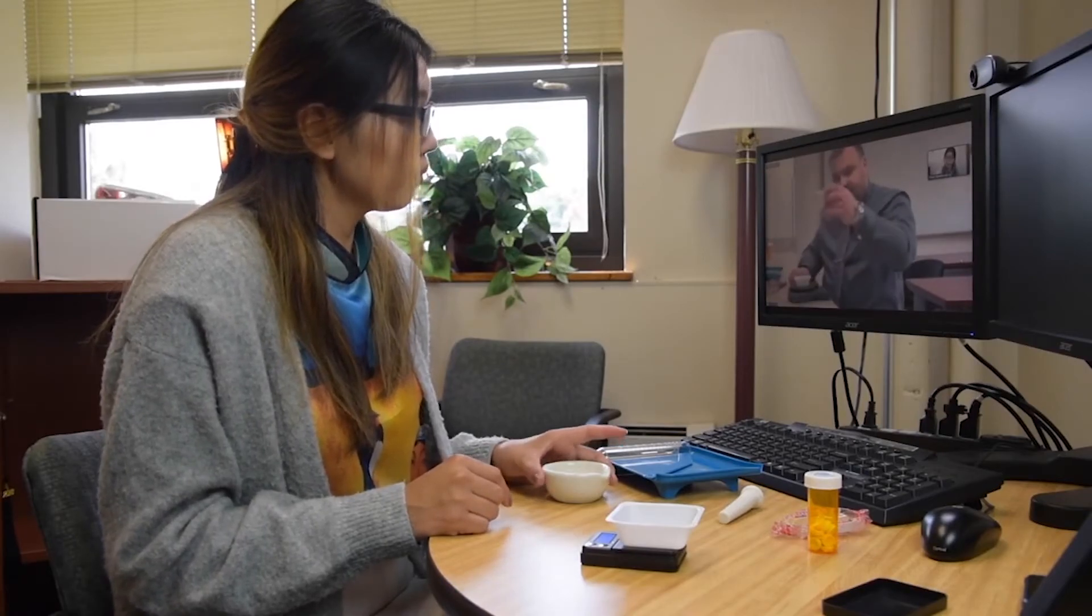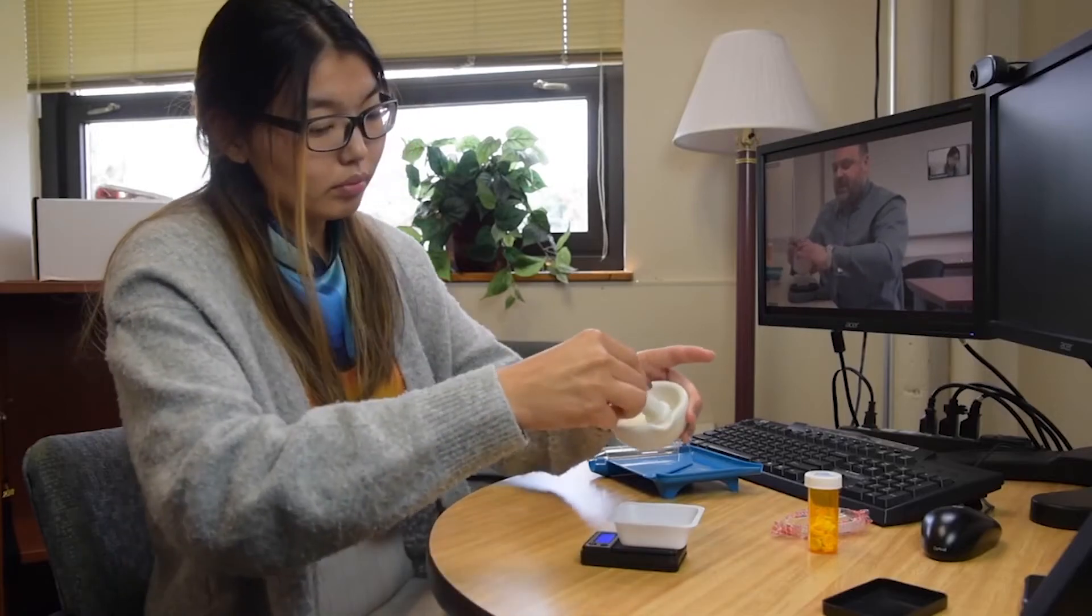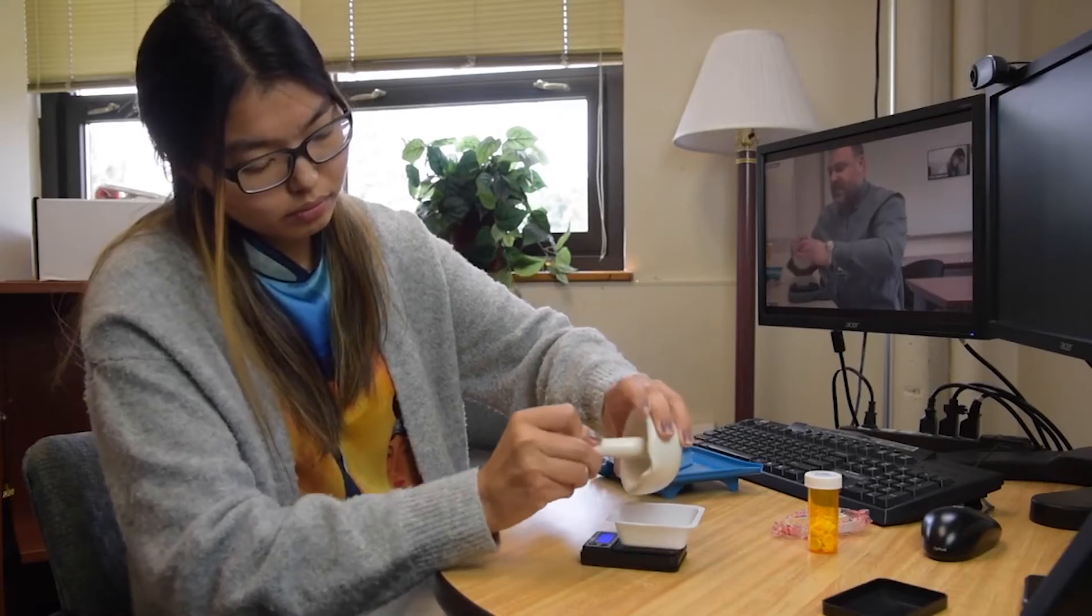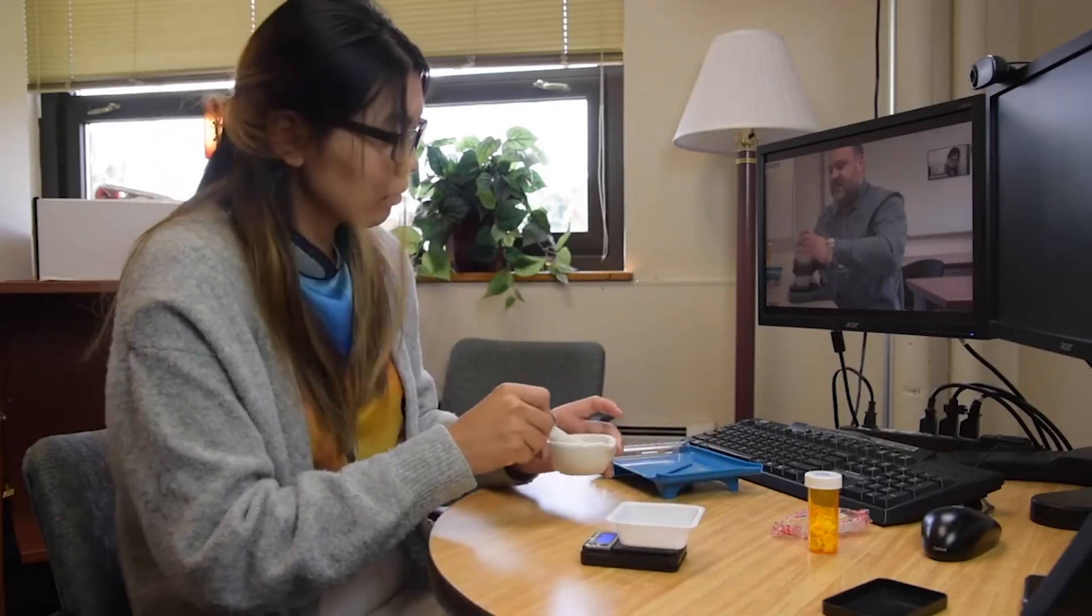Go ahead, pick up your mortar, and you're going to empty all of your powder into the weighing boat. You can use your pestle to scrape any powder that stays inside the mortar.